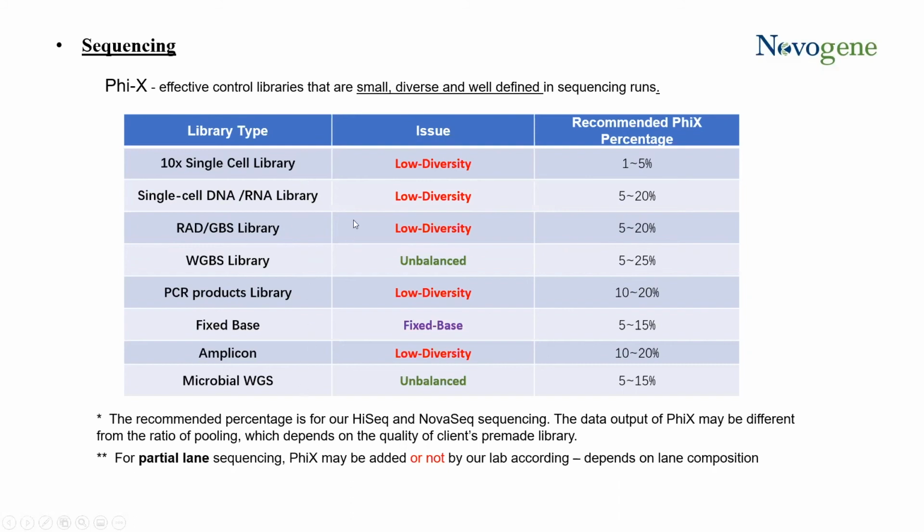So let's go over low diversity libraries. Why should we add phi-X to low diversity libraries? Well, let's say we purchase a lane and we have included 10 libraries on this lane, and we want it to be sequenced and we want even distribution. Well, when we have a low diversity library, it's hard for the sequencer itself to decipher the base calls. Imagine if you have a stretch of A's or T's and all of the outside signal noise, so everything else on the chip is flagging A.